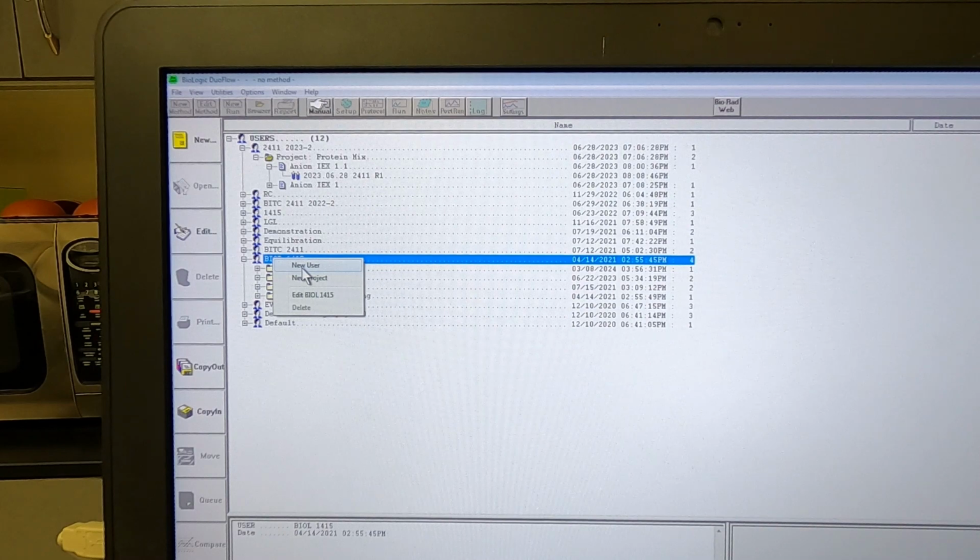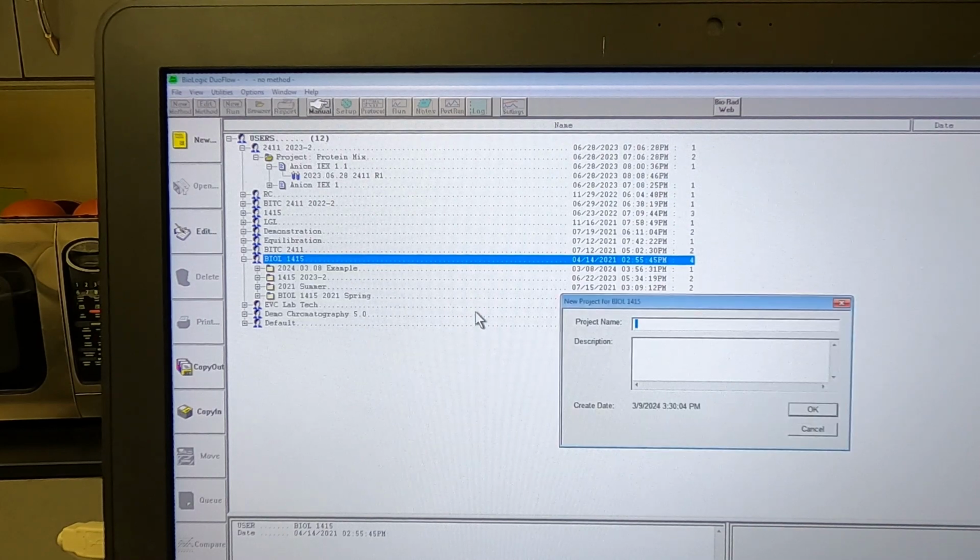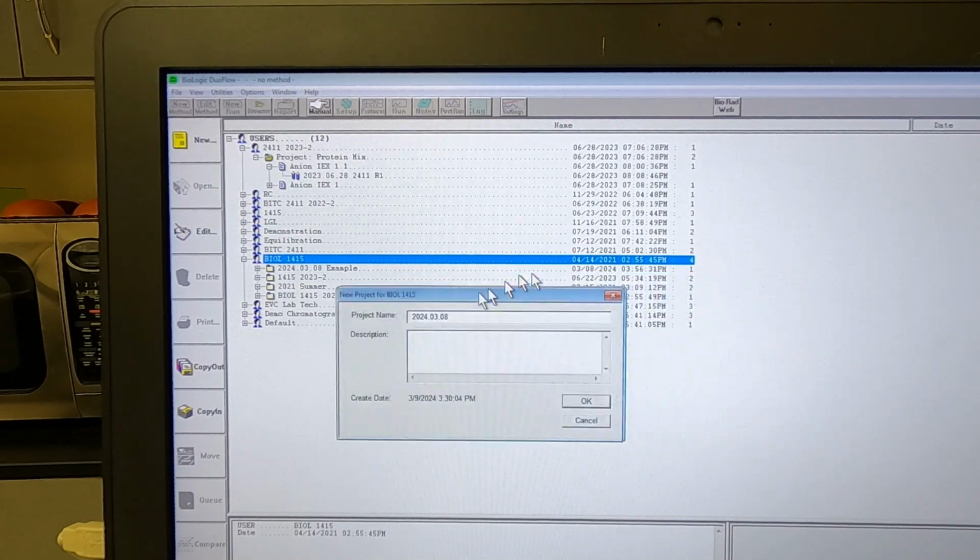I'm going to add a new project to this user, and I like to name all my files beginning with the date, and I do the date in reverse order: year, month, and then day. It is an ISO standard 8601, so I advocate for that. It becomes really helpful once you start to build a lot of files or have to catalog a lot of samples. It's just a quick and easy way to find what it is that you're looking for on a computer.